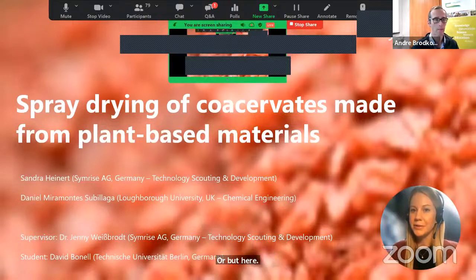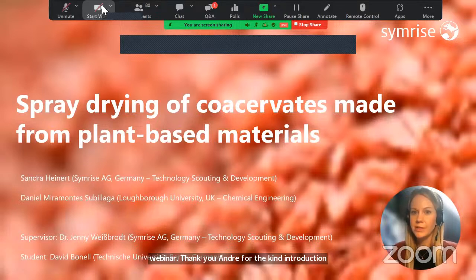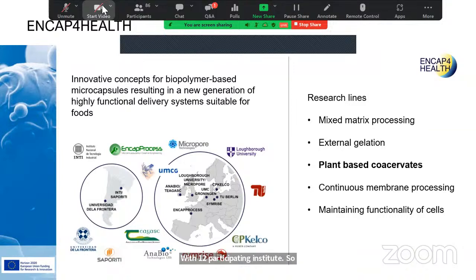Hello, everybody, and also welcome from my side to this webinar. Thank you, André, for the kind introduction. Today, I'd like to talk about spray drying of coacervates, especially the risks of spray drying of coacervates in general, but also made from plant-based material. But first of all, I'd like to thank all contributors for their great work. This project is part of a really great project called Encap4Health, which is funded by the European Union. And within this project, innovative concepts for biopolymer-based microcapsules are developed during a huge knowledge exchange with 12 participating institutes. So feel free to check their website for further information.